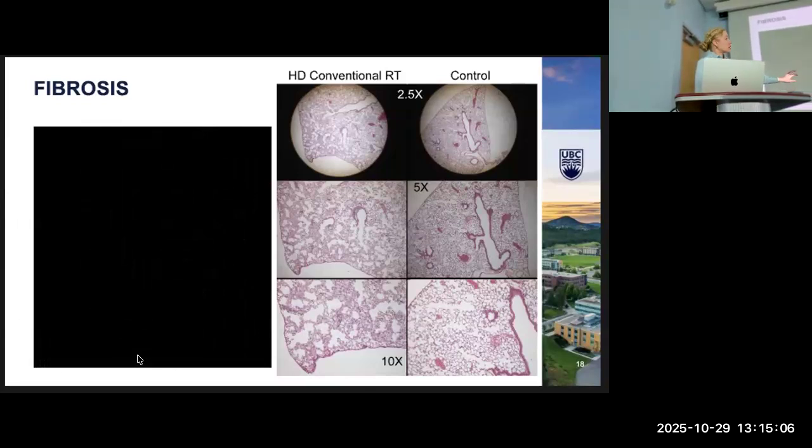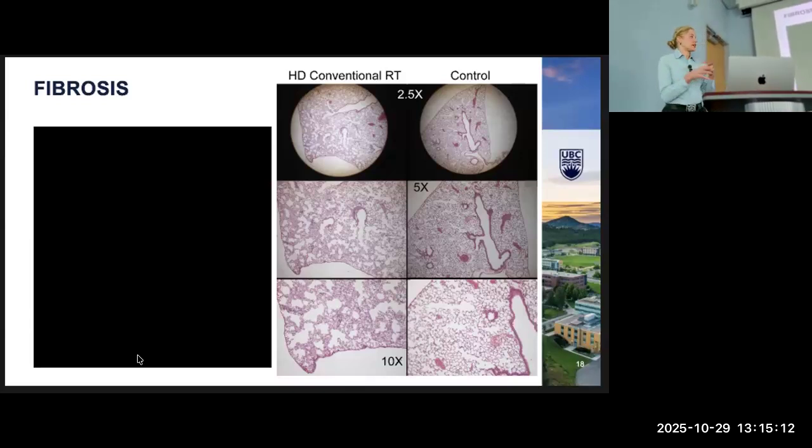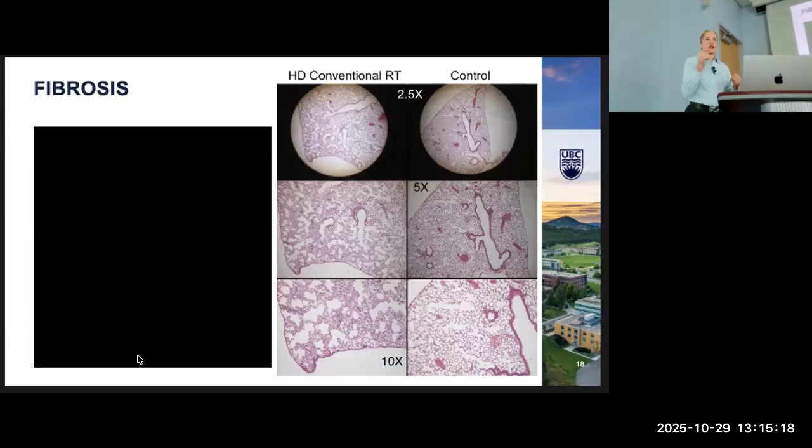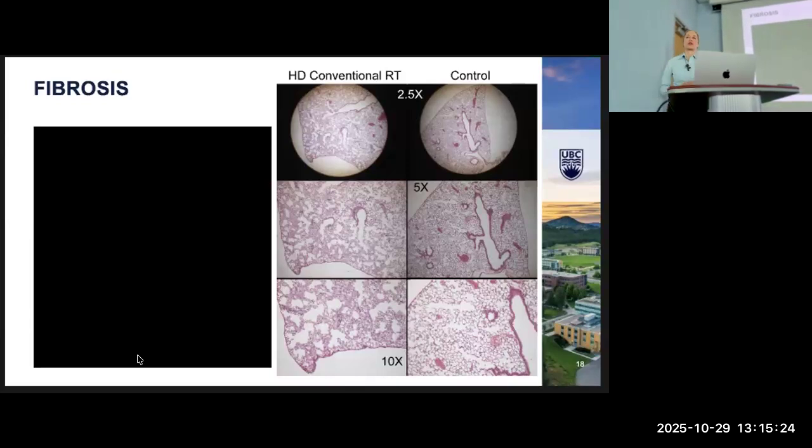And in our radiation therapy case, we can see that there's a lot of clumps of tissue where there's a bunch of red and purple all mixed together and not a lot of airspace. And then other places where there are air spaces, there aren't a lot of septa. And so in that case, we wouldn't expect the animal to be able to breathe quite as well.